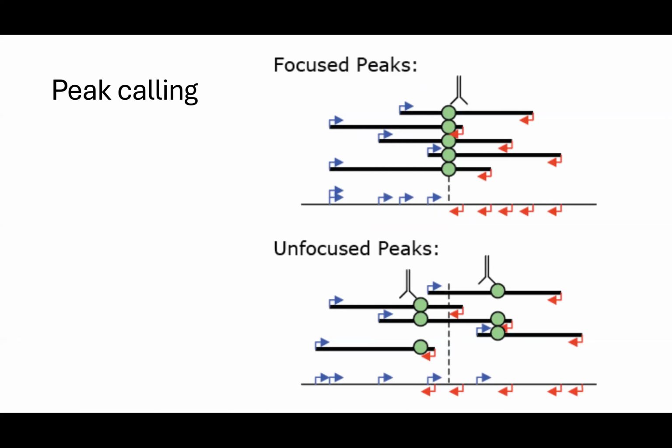And it varies a lot based on how you change the parameters. Here the reads are quite similar between these two. They're a little bit different, but you can see the antibody is supposed to show where the actual thing you're interested in was. If you had something in the middle here, these reads might make sense, where you have some sense reads on this end and some antisense reads on this end, and they're all around this central region.